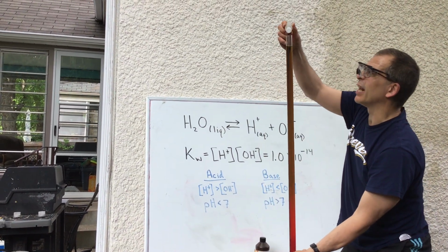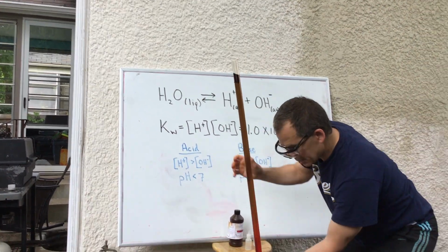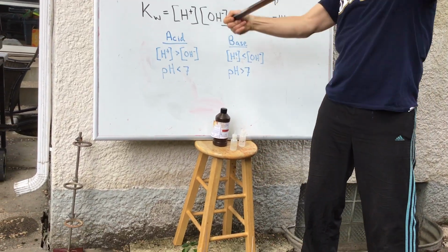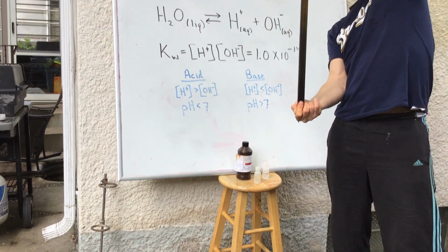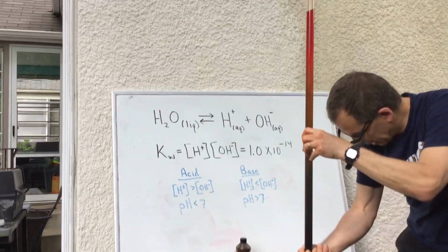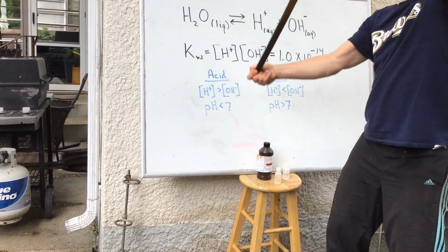And I'm going to add some NaOH. Okay, I'm going to add that. And I need to find the other part of this tube, and I don't know where it went. So I'm going to flip it over like this, and we can start to see that we have red up here, and it's yellow, then it gets to be green, then it's more of a purple down here. Oh, I think I'm finding it. I'm going to flip it back over.